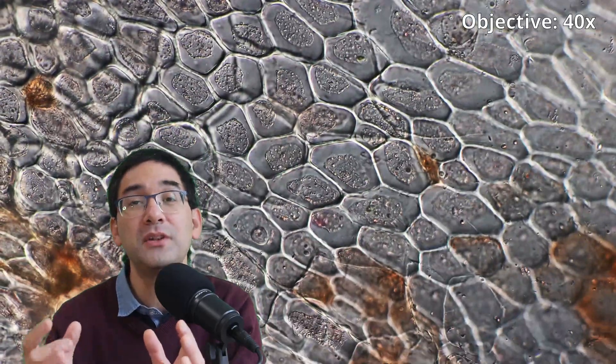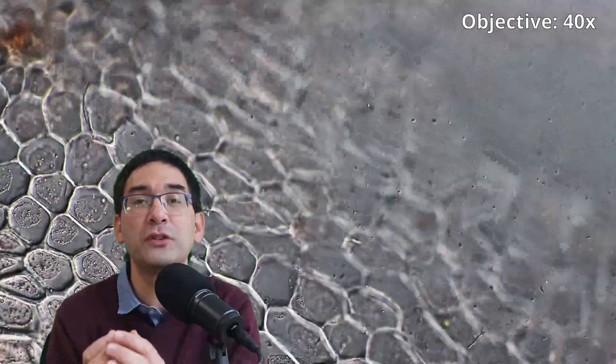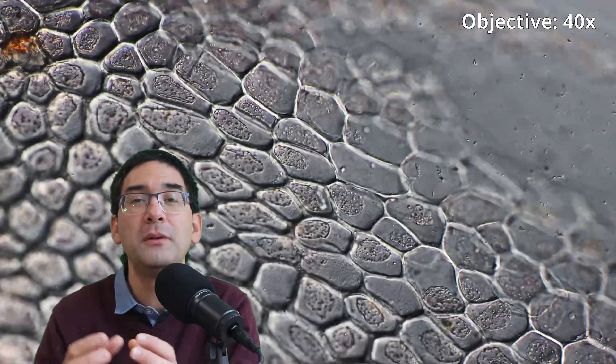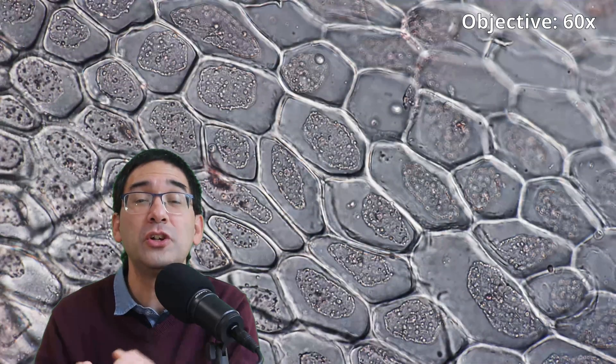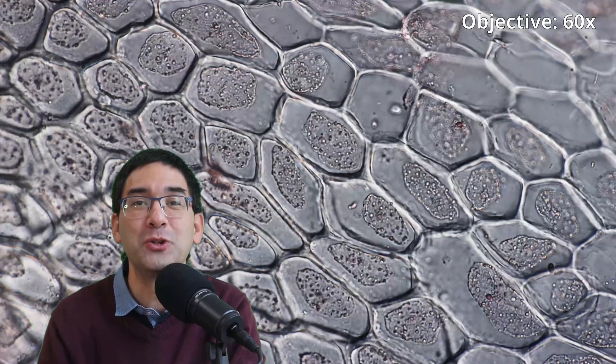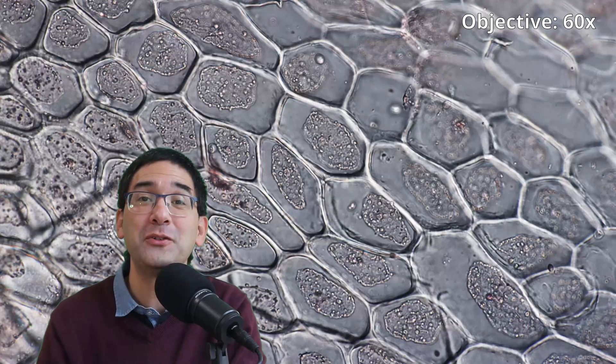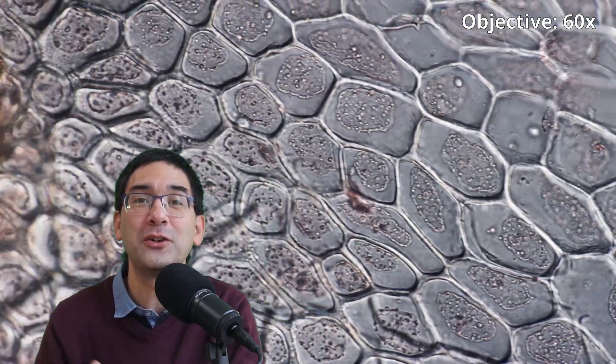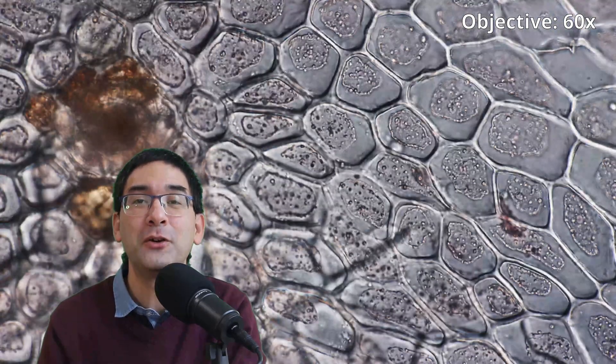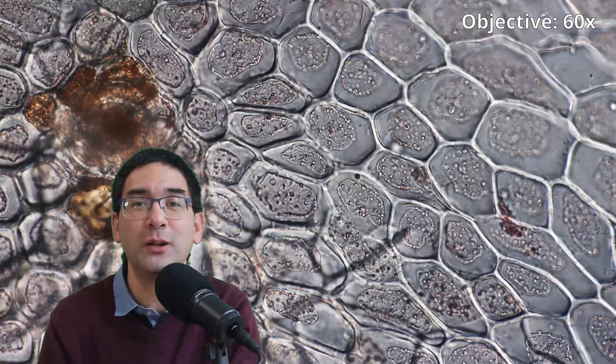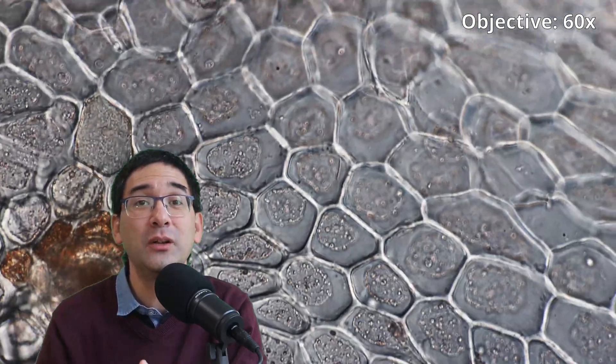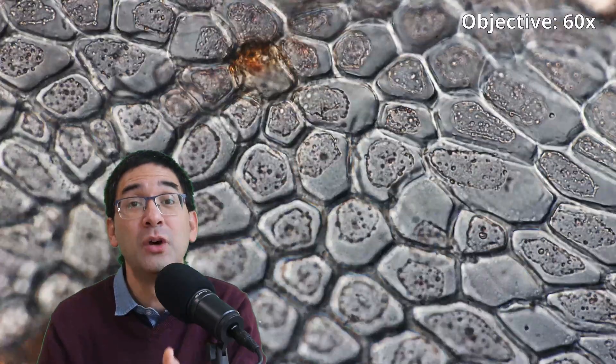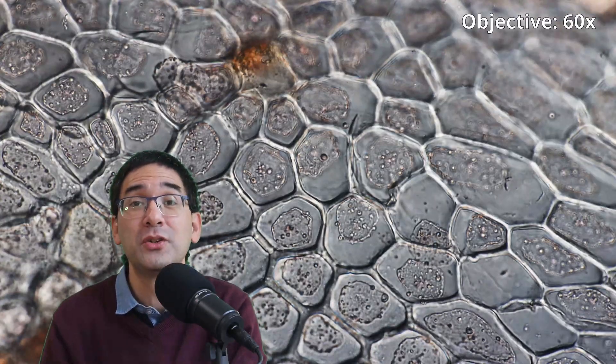It does not seem to fill the full cell because I think the cytoplasm must have lost of course a lot of its volume because it started to shrink when the cherry was placed into a concentrated sugar solution. Now back in the day, a few hundred years ago, when people first started to do microscopy, many biologists were very interested in the cell wall.